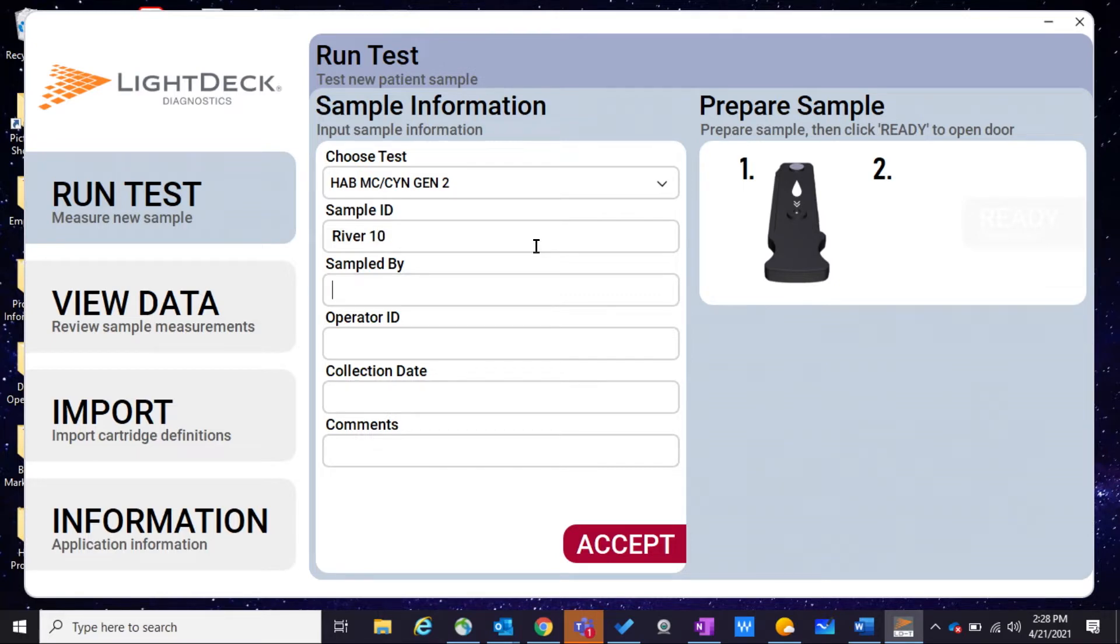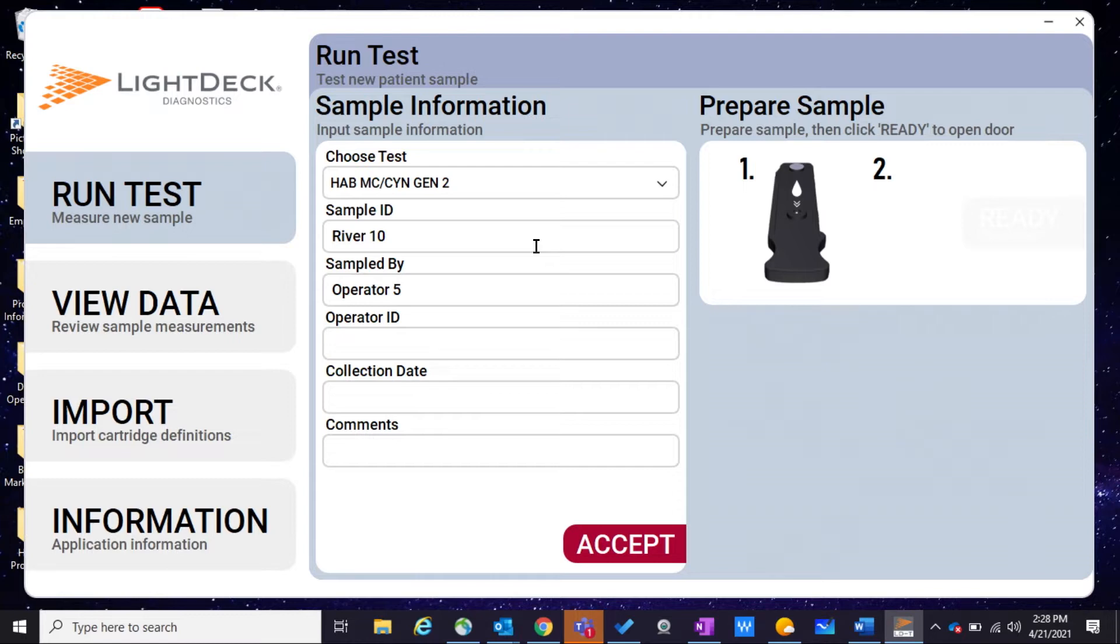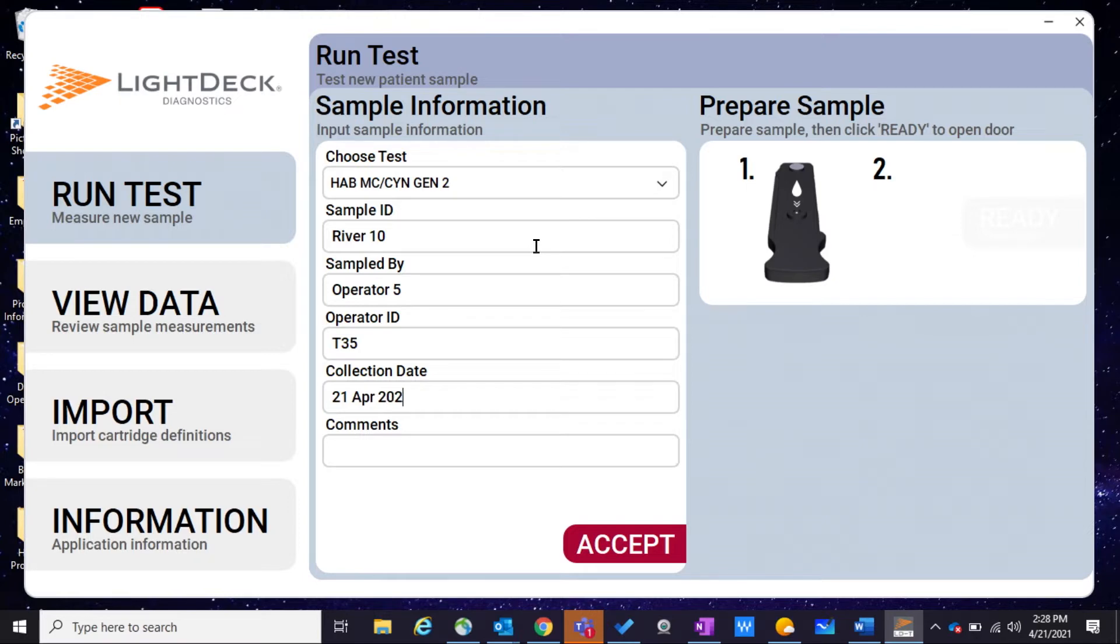And then who collected the sample, the operator ID, the collection date, and any comments on that sample.